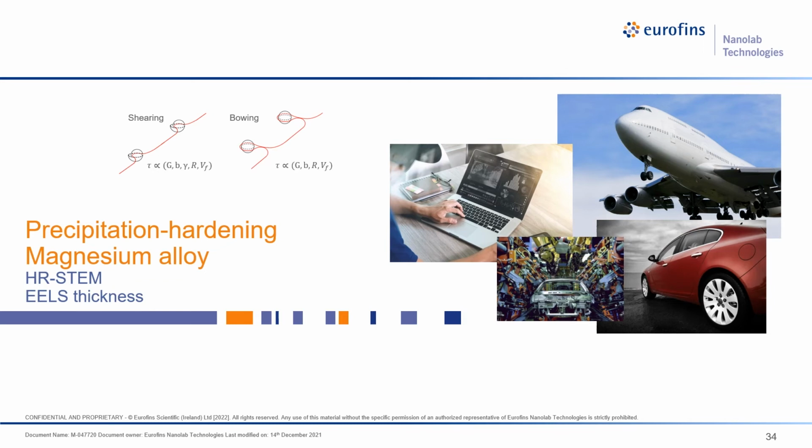So it is of essential importance to understand what these particles are: what their compositions are, what the crystal structures are, and what their preferred orientations are. And we also need a quantitative understanding of these particles, like how many particles you have in the material system, what their volume fractions are, etc. We will use STEM and EELS to achieve both qualitative and quantitative understanding of these particles.